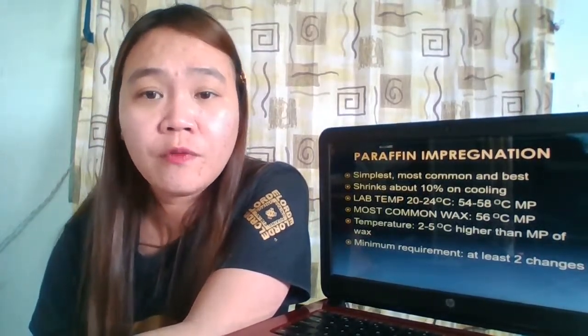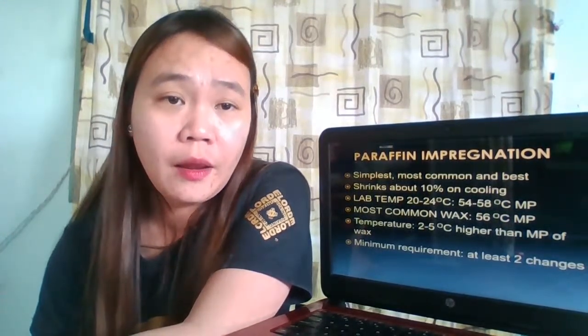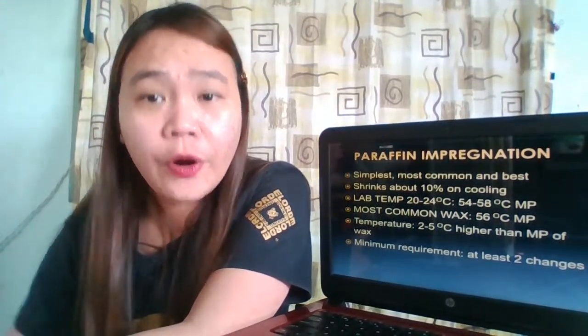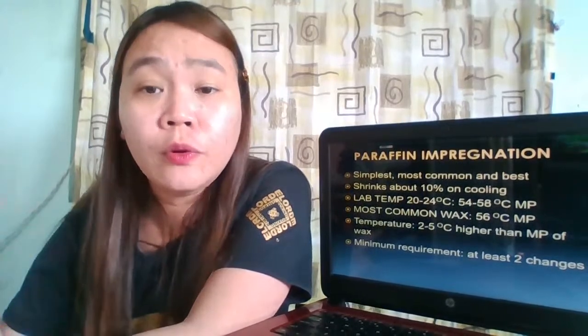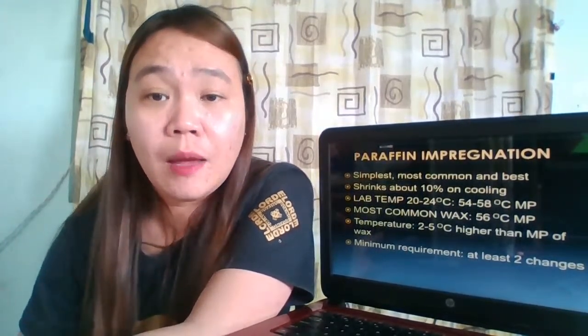Why do we have to perform dehydration and clearing? In order to make our tissue sample compatible to the reagent that we use for impregnation and embedding.